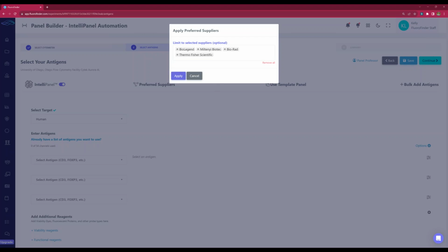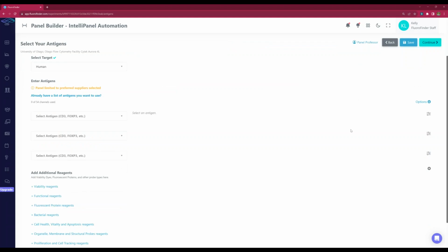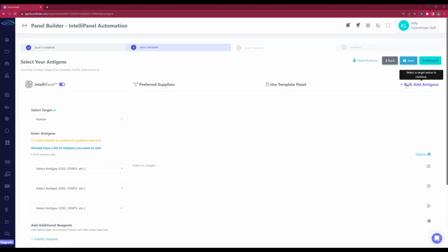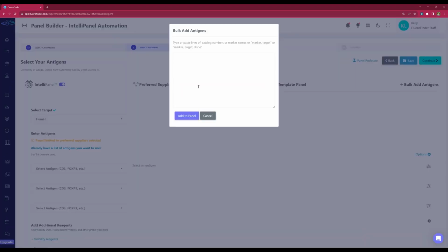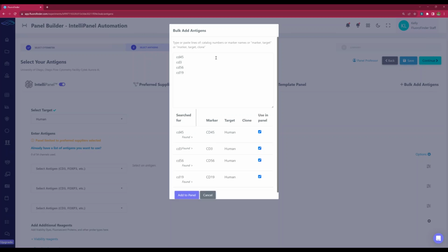For a specific instrument that she has, she has spare bandpass filters that she can change for specific panels. So basically she's got a couple of bandpass filters that she interchanges for particular panels. Do you have to have numerous instrument names to be able to use this panel builder, or can you have one instrument name with numerous filters associated?